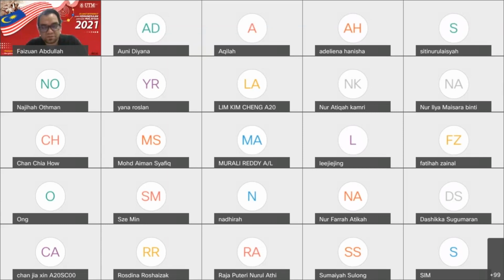So we have this instrument. For the first experiment, if you can remember, for those who have done it in the physical lab, and also for the majority of us who listened to me and other lecturers in the virtual lab session the last 2 days for experiment 1, it is the classical method. We call that a classical method to determine the metals in a sample using gravimetric analysis. What is gravimetric? It is based on the word gravity, meaning we measure the mass.